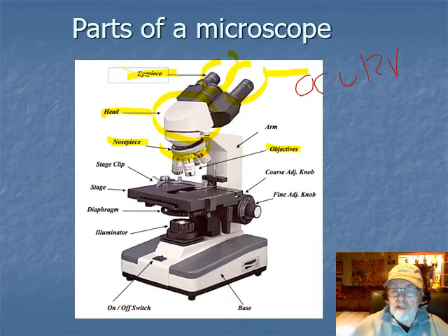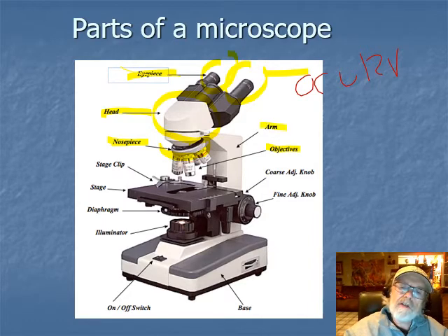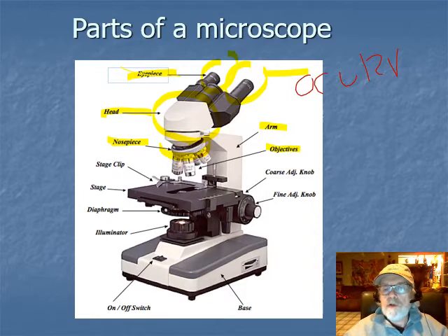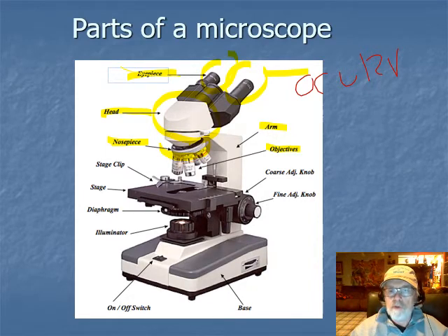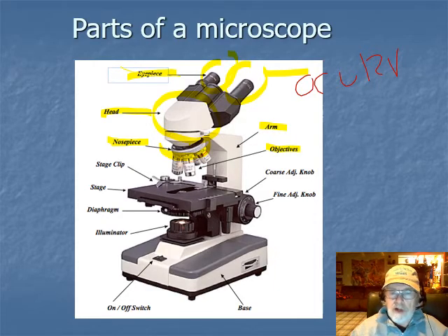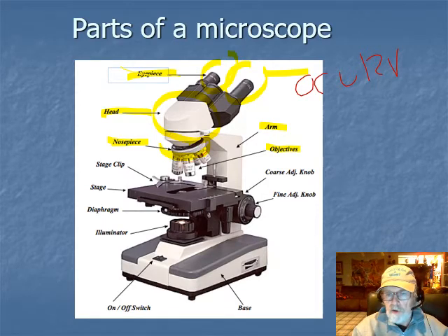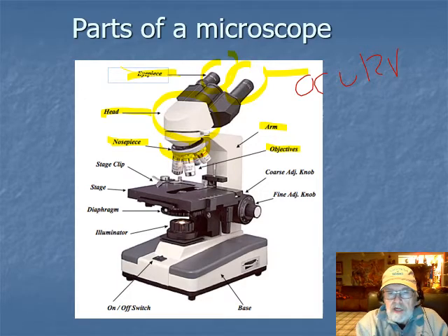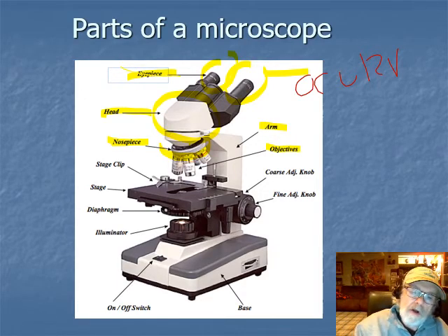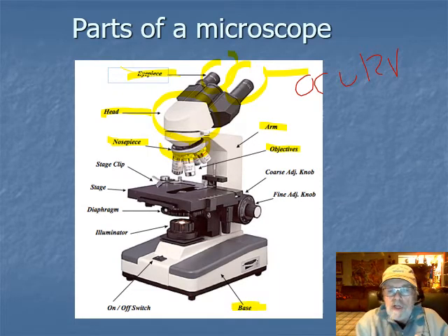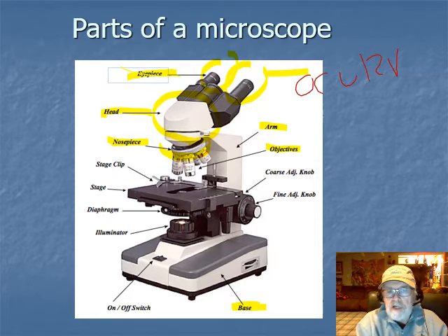This area back here is called the arm. When you carry a microscope it's always important to use two hands. You grab the microscope by the arm, lift it up, and put your hand underneath the bottom, which is called the base. You carry it holding it by the arm and under the base.